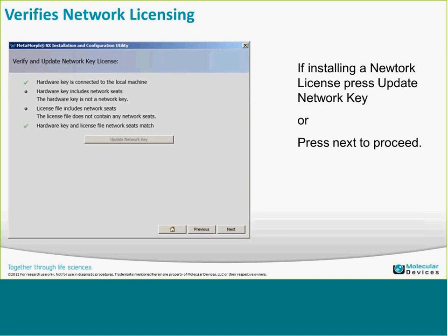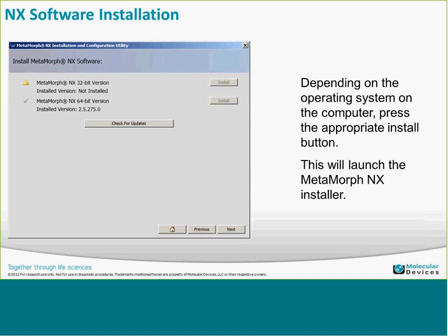If you're not doing a network licensing install, just click Next through this section. The last section is the actual software installation. Depending on your operating system — whether 32-bit or 64-bit — you can also install a 32-bit version onto a 64-bit OS, though most hardware drivers are now 64-bit compatible. If you're on a 64-bit OS, I'd recommend the 64-bit option.